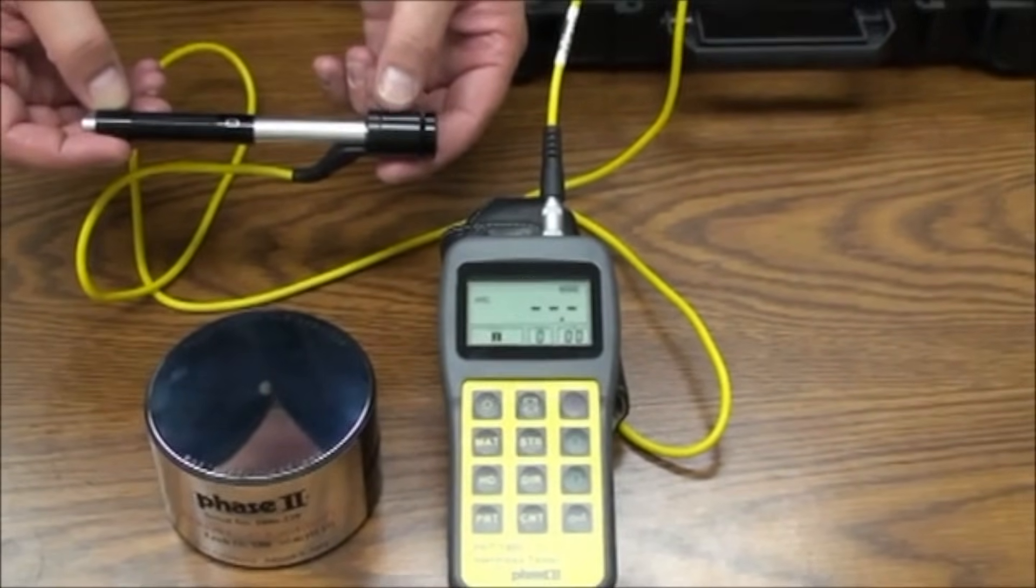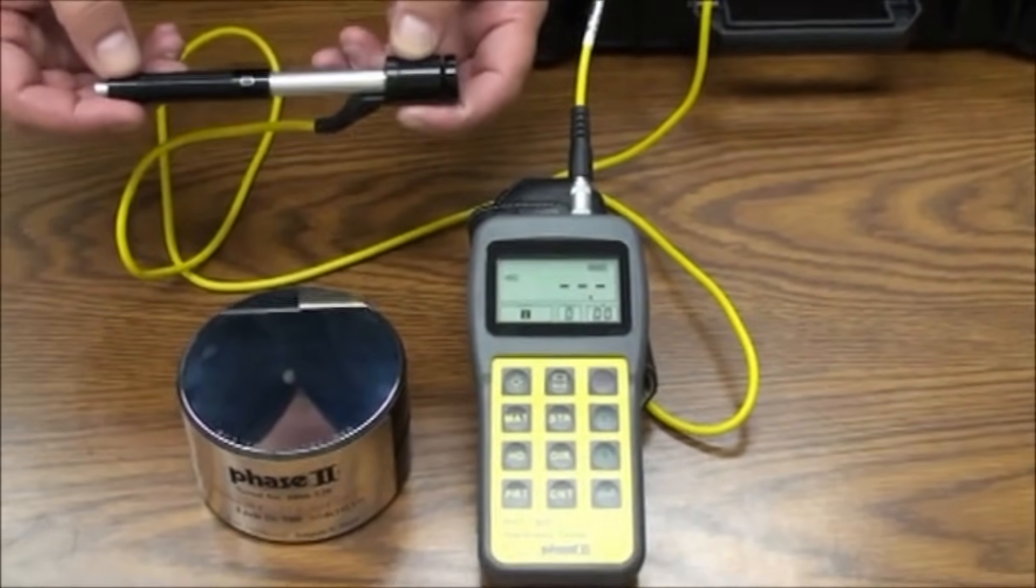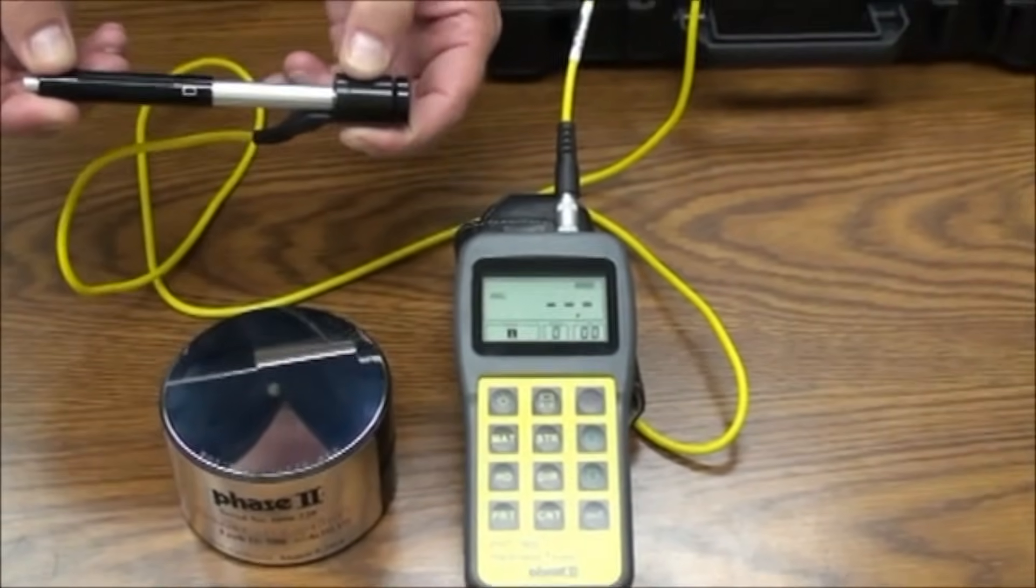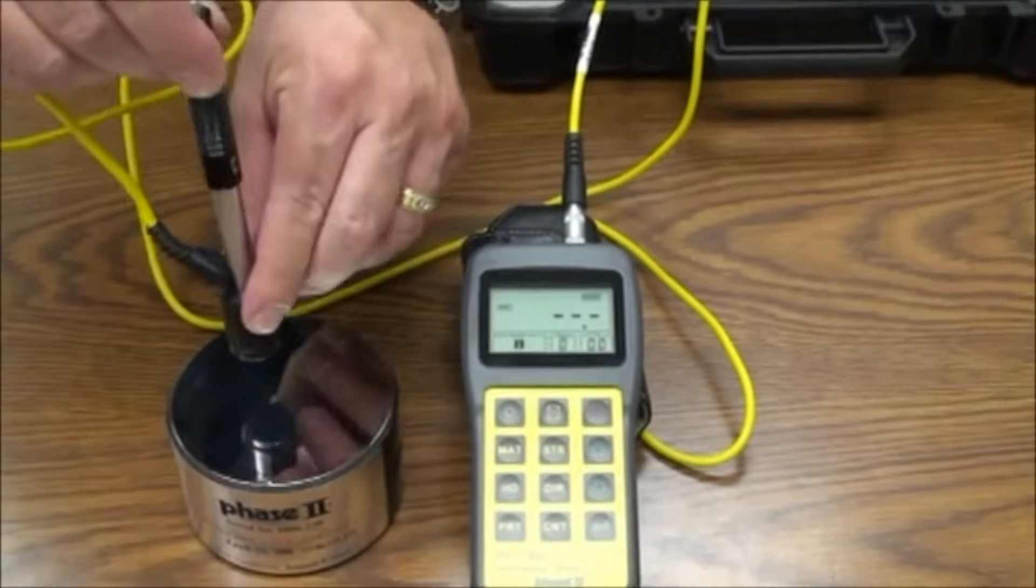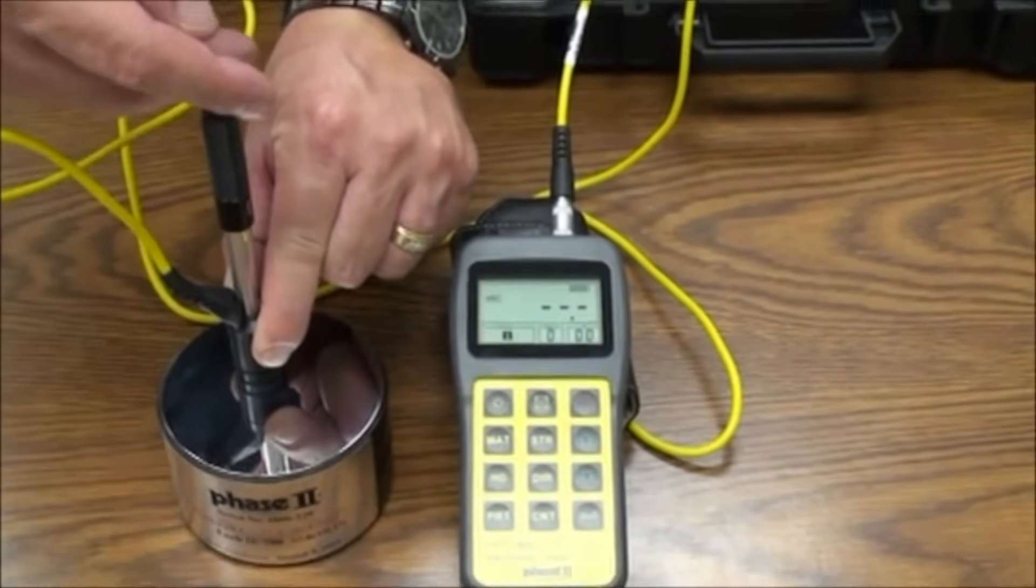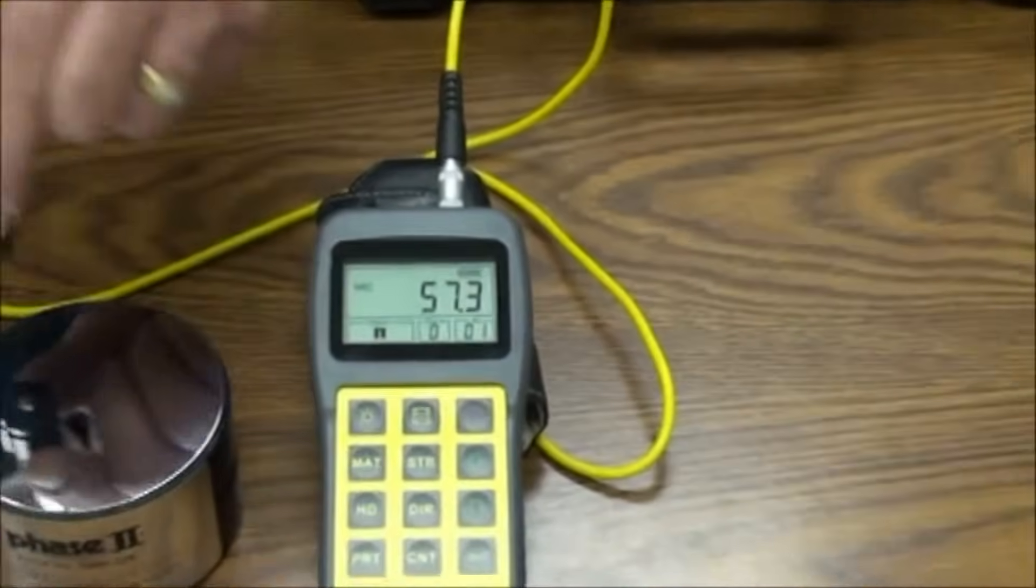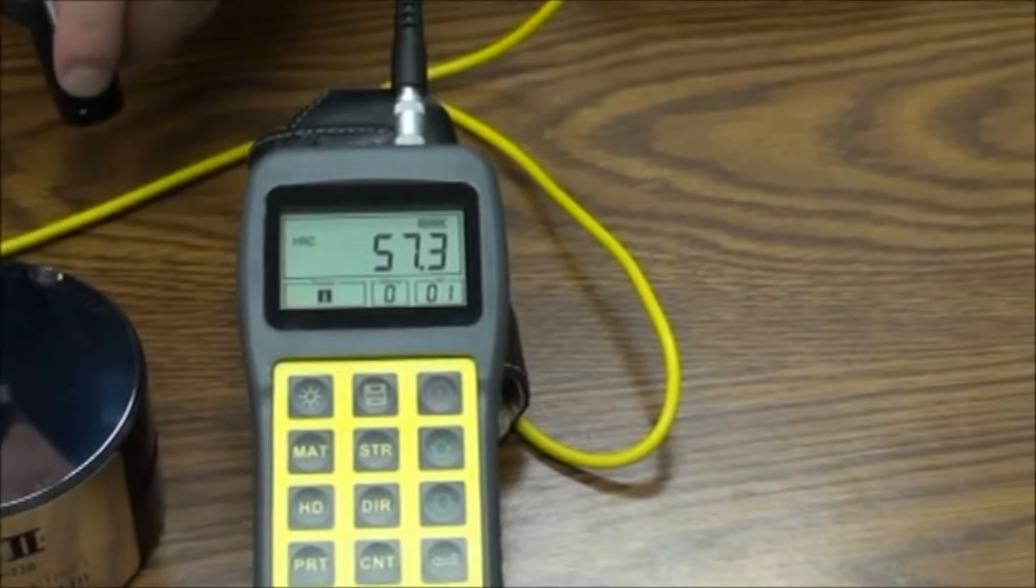Taking a test or a series of tests is quite simple once your parameters are all set. Load the impact device just like you would load a pump action shotgun. Place the end of the impact device flat on your workpiece and release the load by depressing the top button. You will see the results shown on screen.